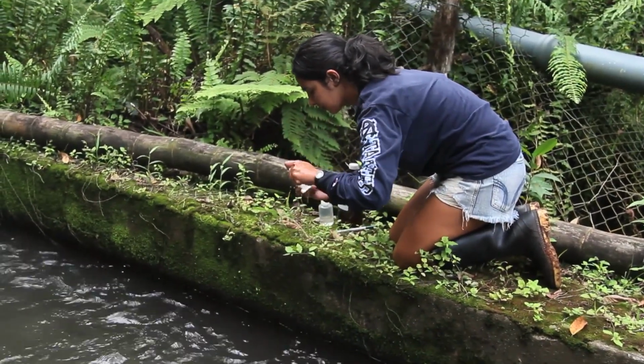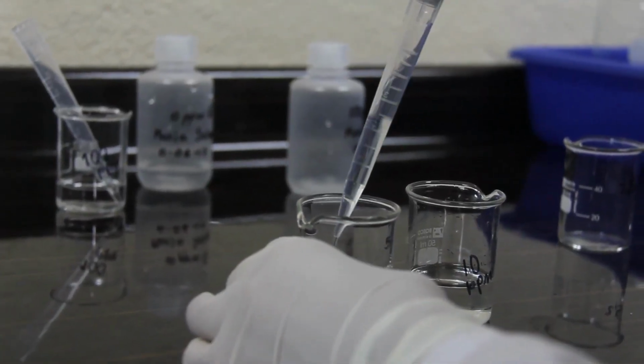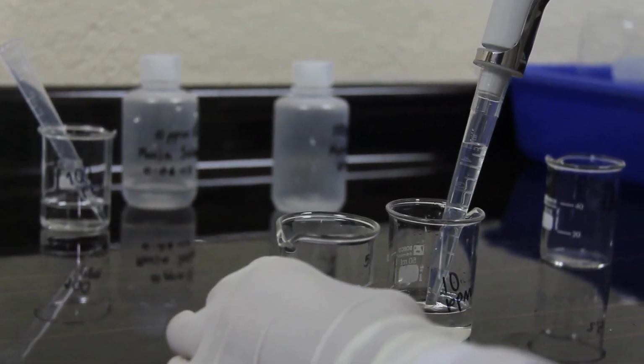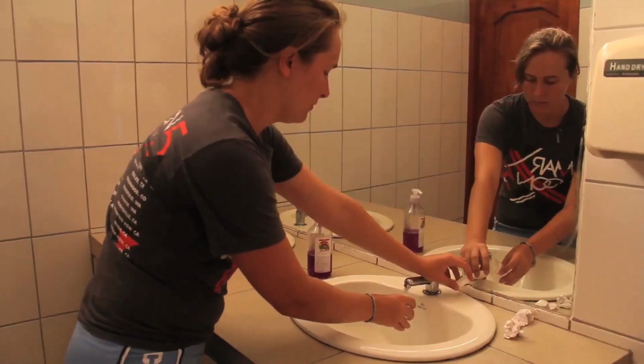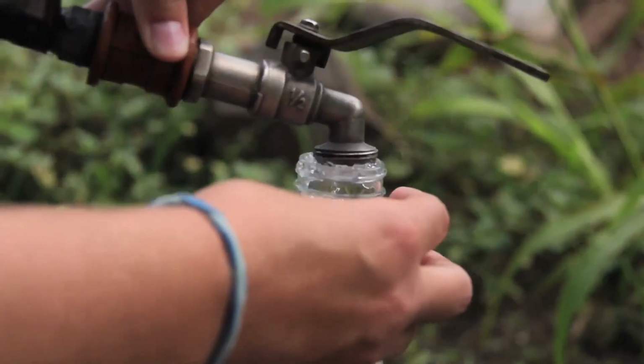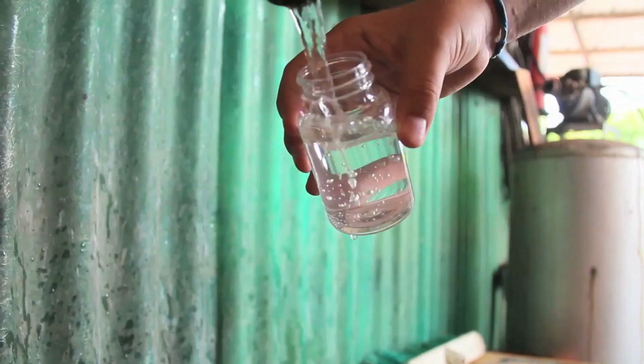And we're also doing physical and chemical tests just to see how the water quality is. Some of those physical tests include chlorides, sulfates, residuals. Our project is focused on rainfall, so every time it rains, the day that it rains, the day after, and the day after that, I have to go collect samples of tap water from different places around the island. So some of them are homes, some of them are businesses, and then some of them are public places like the Municipal and the public bathrooms that are down by the Malecon.